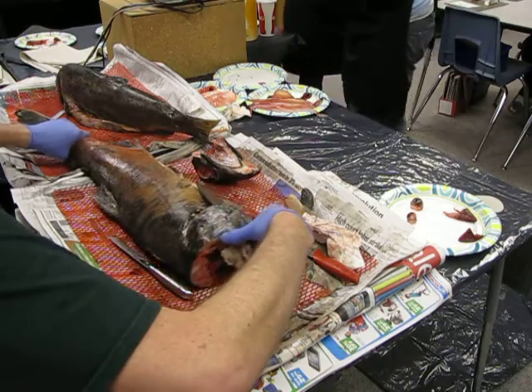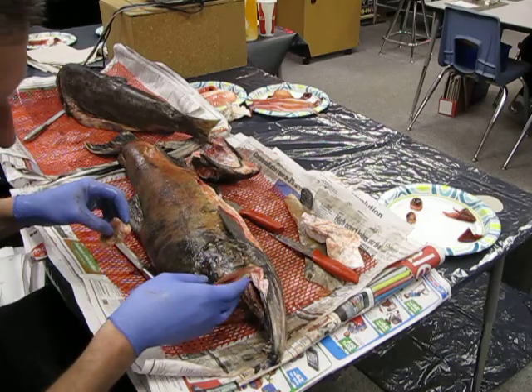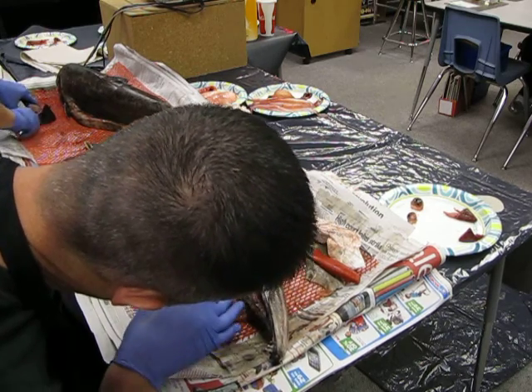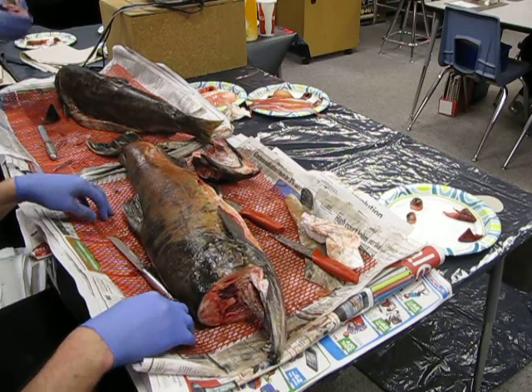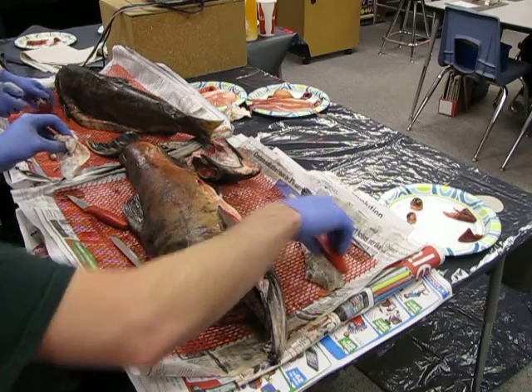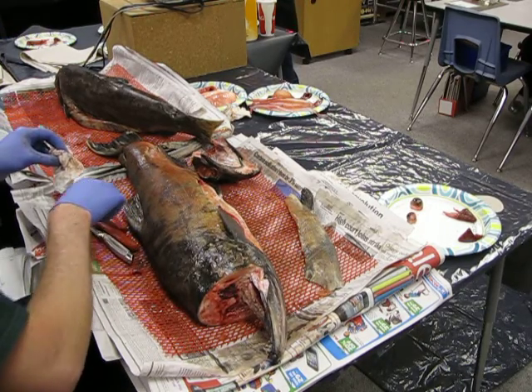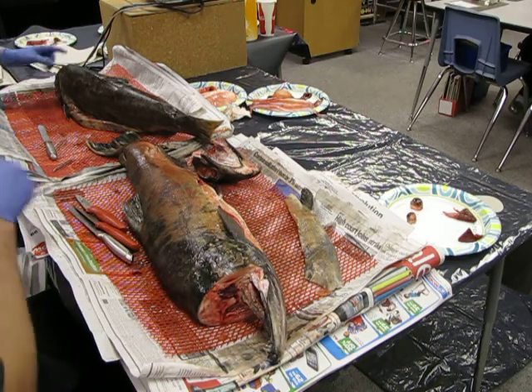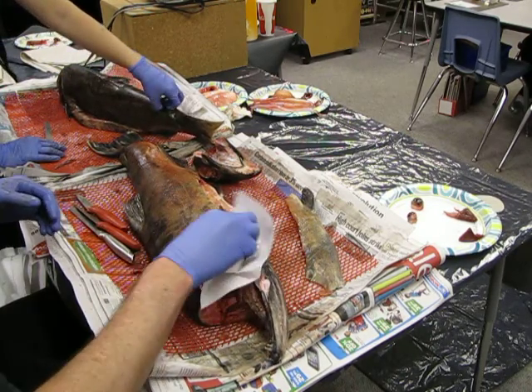All right, so on the plate, you guys, we have some brain material. It's kind of mushy because the fish is so old. When you come up and take a look at this, this is the other thing that you won't be able to touch. You won't be able to touch the swim bladder or the brain, but I do want you to look at it and observe how small it is. And we have the back of the skull, so here's the eyeball of the fish and the hooked nose, right? The kype. In the skull itself, you can see the brain cavity, the hole where the brain was, and I'll put that up here too. Can you see that hole where we took the brain from?